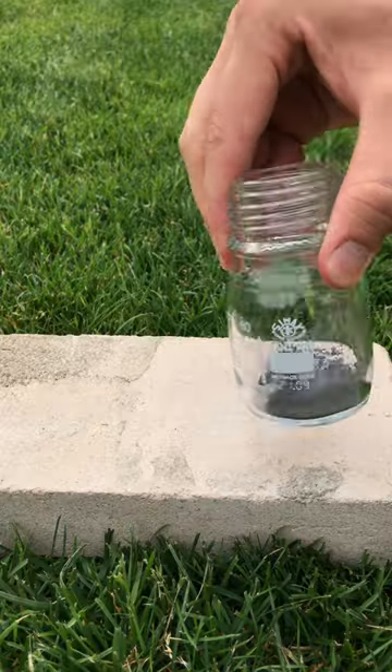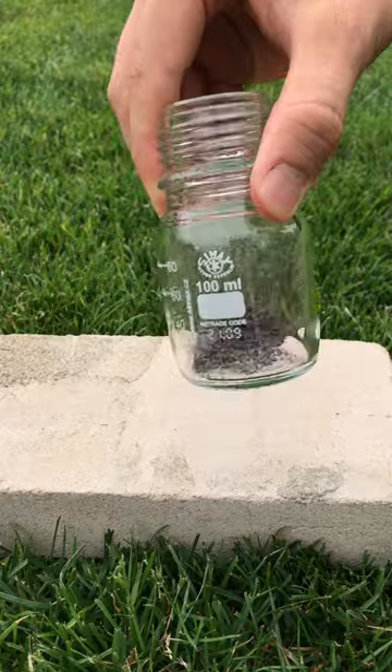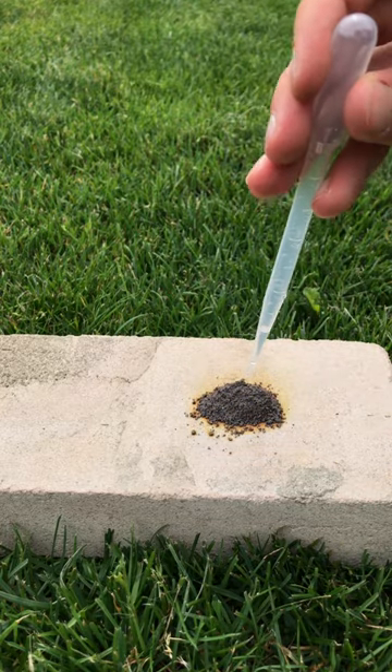This is elemental iodine and this is aluminium powder. When you mix those two up and add some water, you can get an interesting reaction. Iodine is a very reactive element, but aluminium has a thin oxide layer on top of it, which makes it relatively inert.